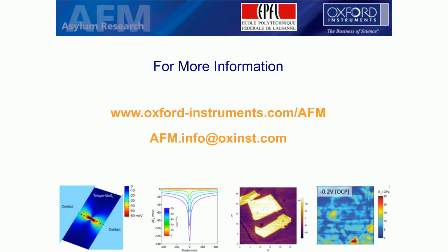Okay, and a question about bias. How do you bring bias to samples when you're measuring operating transistors using KPFM? Use bonding or probe tips? Seems a lot of questions about probe tips. Yeah, so I guess that's for me. So we use wire bonding to very small chips, something like 20-pin chips, and that was what we initially did.